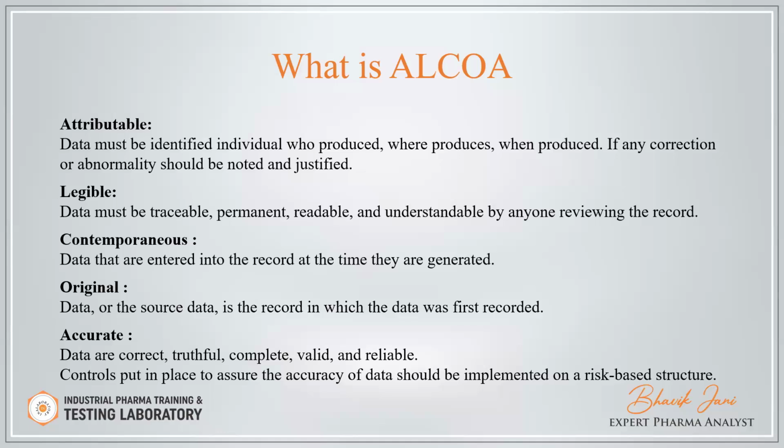You have to prepare the document with the understanding of those employees. If the employee doesn't know English, you have to prepare your document in Hindi or Gujarati or Marathi or the local language.